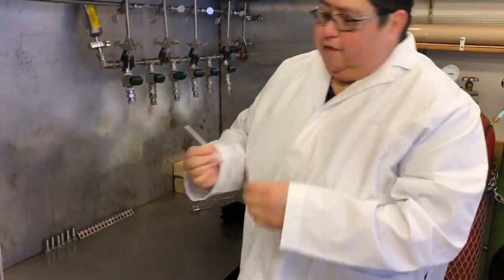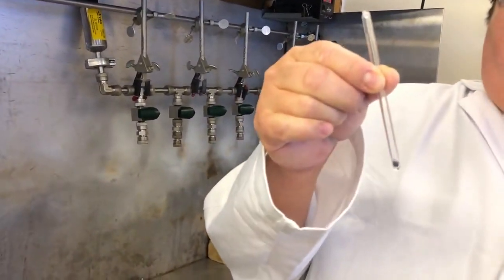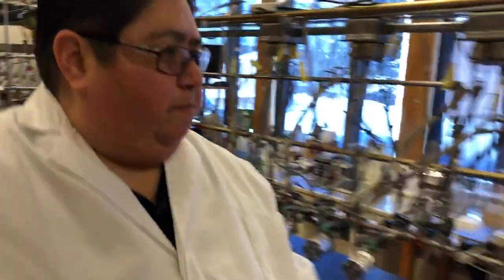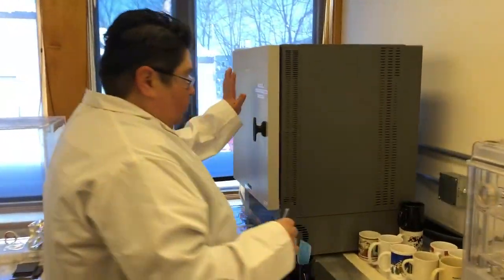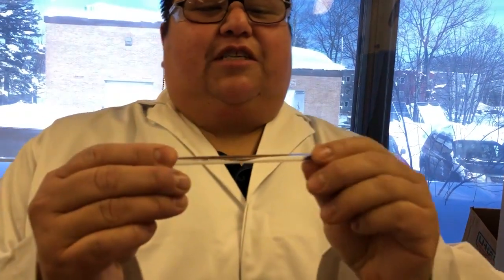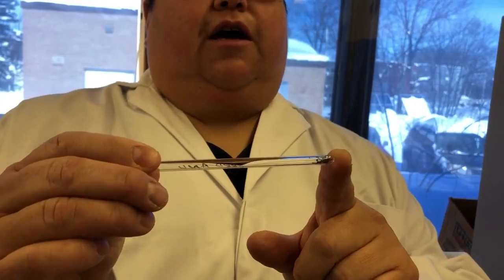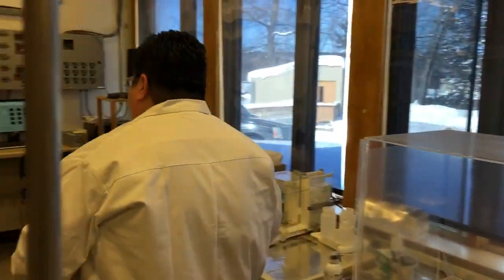Okay, so now that I've got my sample isolated and torched off into this tube, I'm going to put it into a combustion furnace and cook it at 900 degrees C. Now we're going to walk back across this expansive lab. So this is my furnace. My sample will get loaded into there. I'll combust it for about 4 hours, and out comes, guess what? Another sample. As you can see, there's no more wood in there. The sample has completely turned into CO2. And there's still some oxidizer in there, but that's okay.